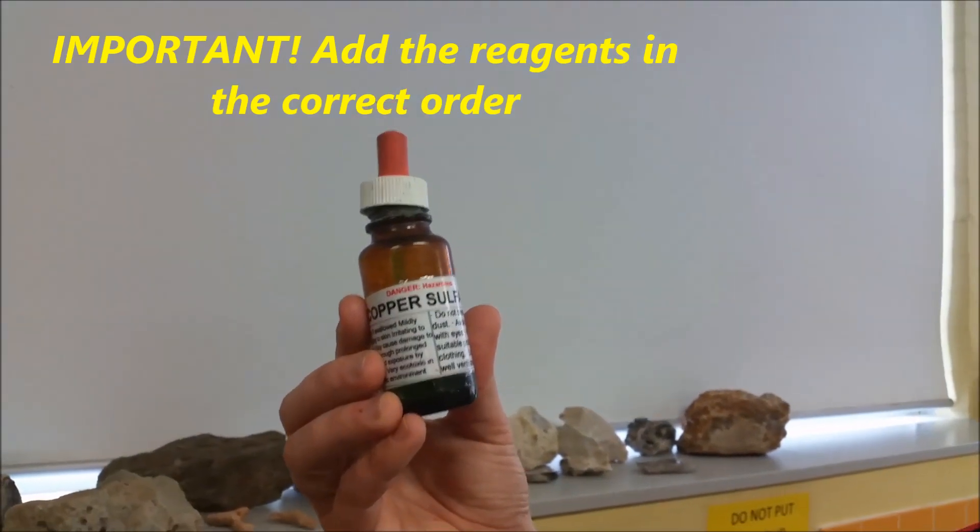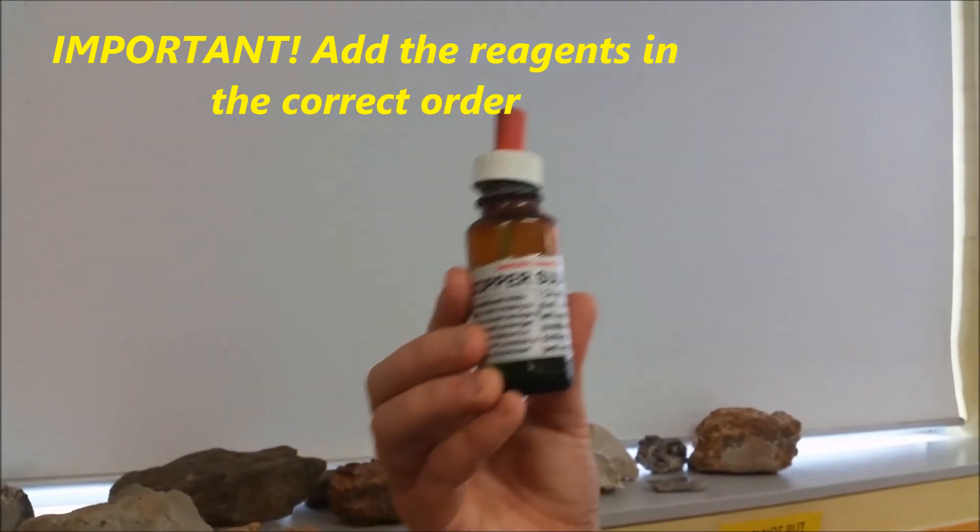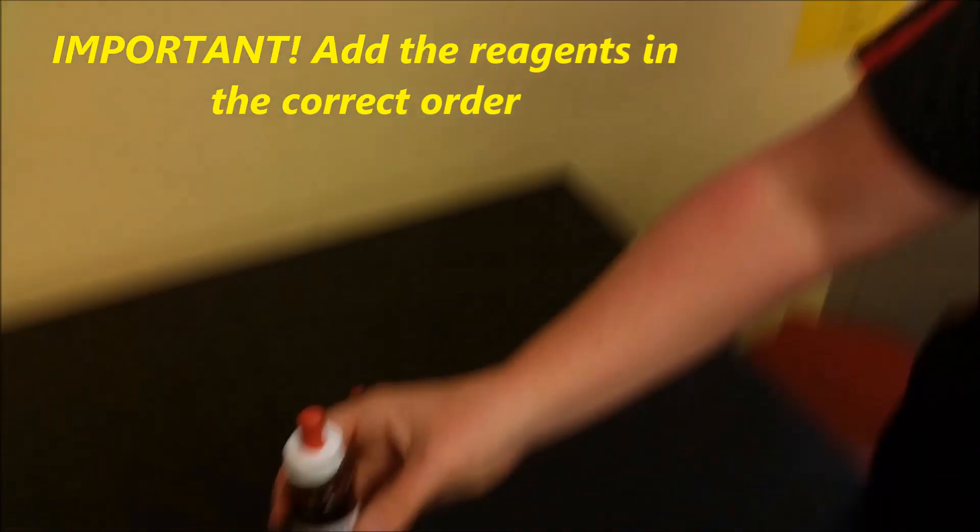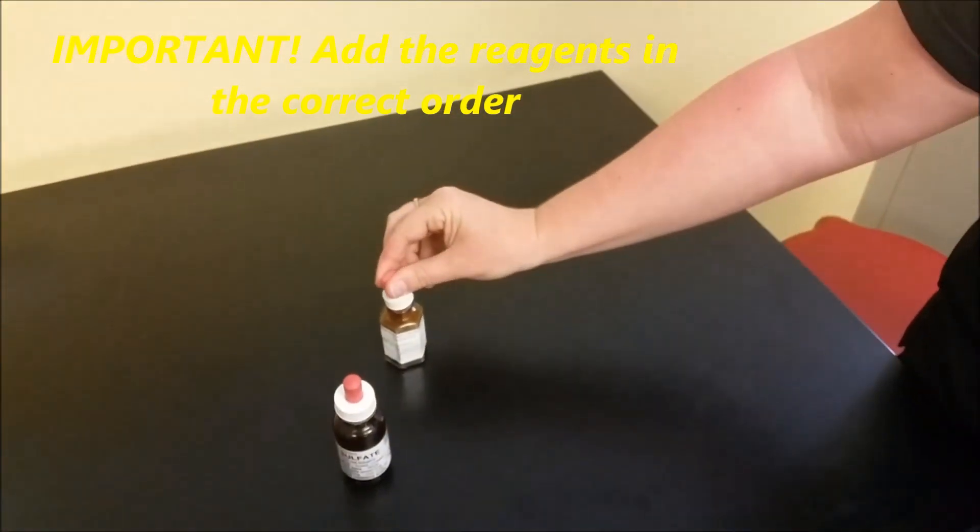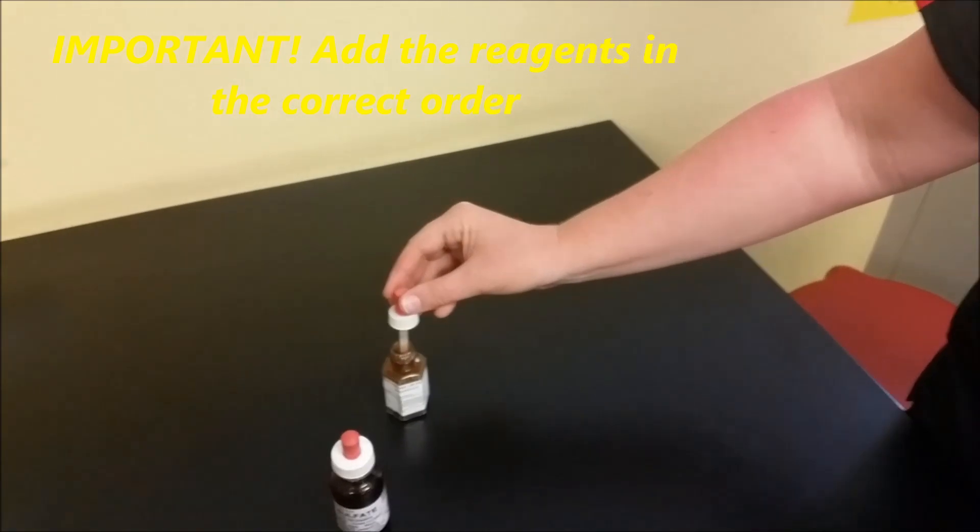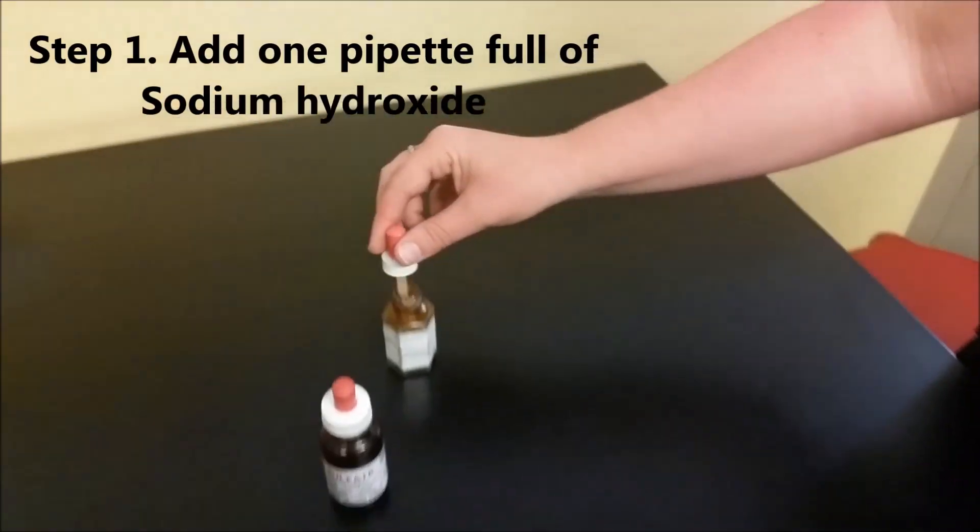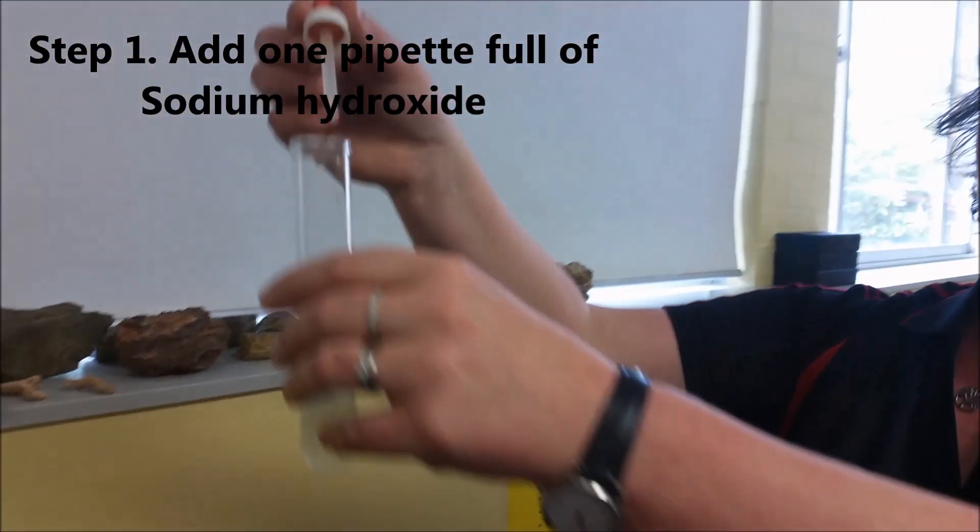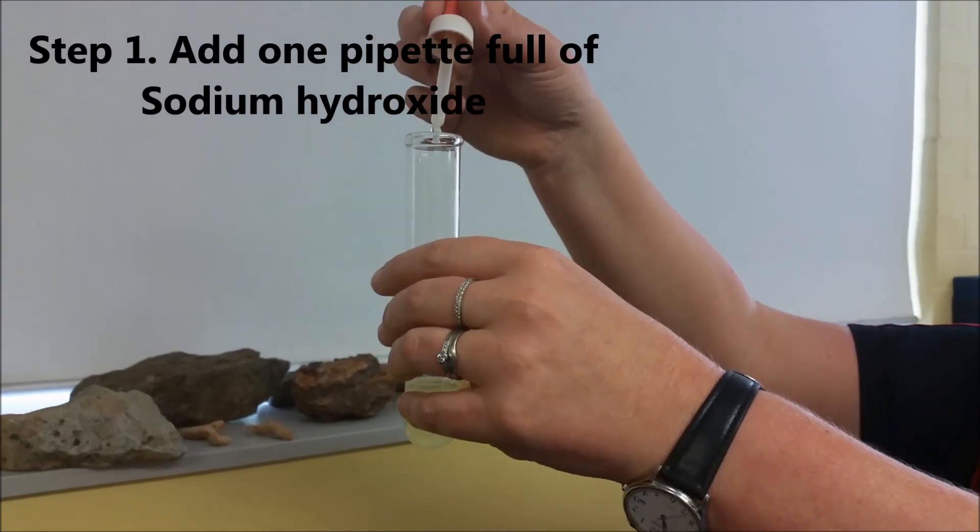Make sure that they are in separate trays, make sure you get one of each. When you do the protein test, it's important that you add these in the correct order. The first step is you add one pipette full of the sodium hydroxide.